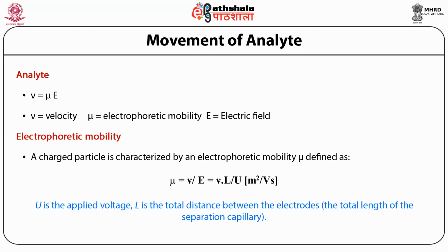Electrically charged particles move in the applied electric field in a direction determined by their charge and the field orientation. Positively charged particles move towards the negative pole and negatively charged particles move towards the positive pole. A charged particle is characterized by an electrophoretic mobility μ, which is defined as μ = v/E, or v × L/U, in m²/Vs, where E is the intensity of the electric field, U is the applied voltage, and L is the total distance between the electrodes, the total length of the separation capillary.